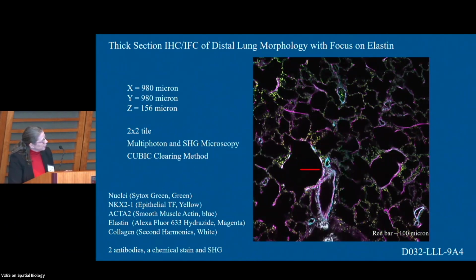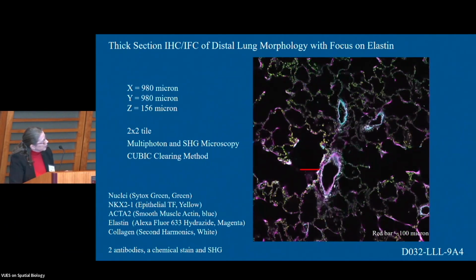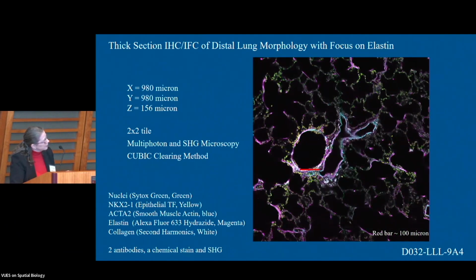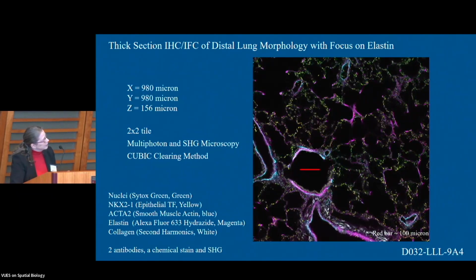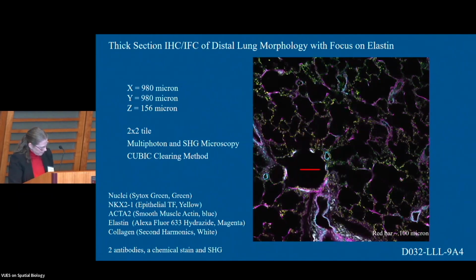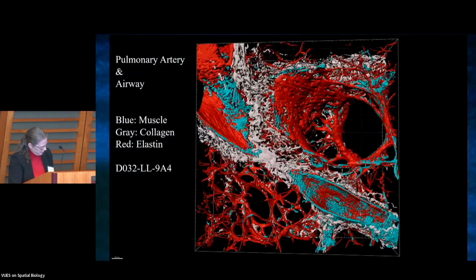Here as a serial Z-stack, you can see the blood vessel that is heading up to the right now and dividing into 2, and it's sitting right next to that round airway. Here we go back across the view, and you can follow it through. So we can make measurements and understand relationships in this kind of image.